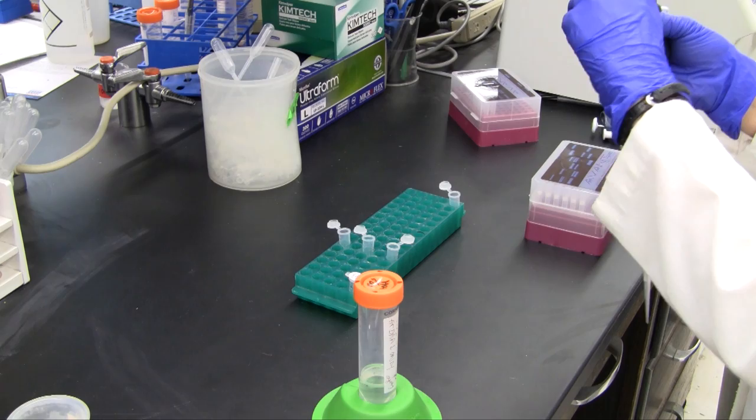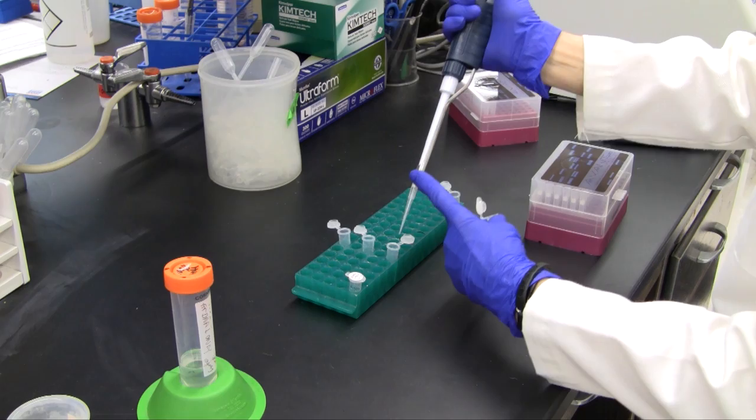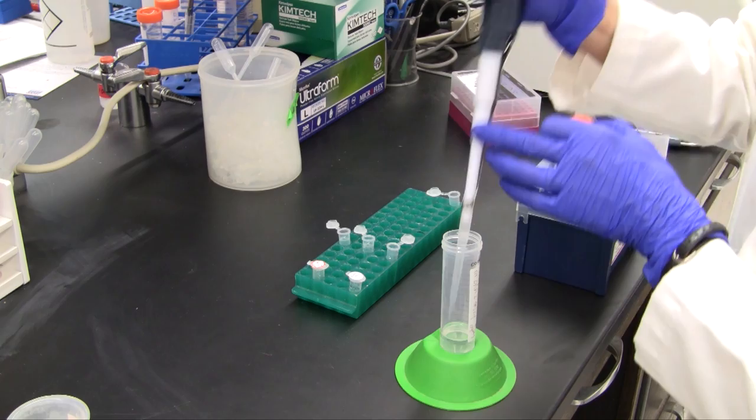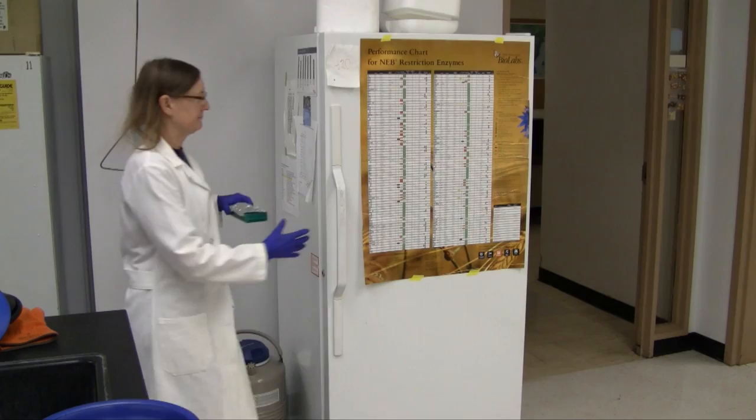Red probes can now be purified by ethanol precipitation alongside blue and green probes. 1/10 volume of 3 molar sodium acetate and 2.5 volumes of 100% ethanol are added and mixed with the probe. Additionally, sheared salmon sperm DNA is added to the mixture to act as a carrier. Green and blue probes are first brought to a total volume of 100 microliters with TE before ethanol precipitation. The mixture is vortexed thoroughly before being placed at negative 20 degrees Celsius overnight.